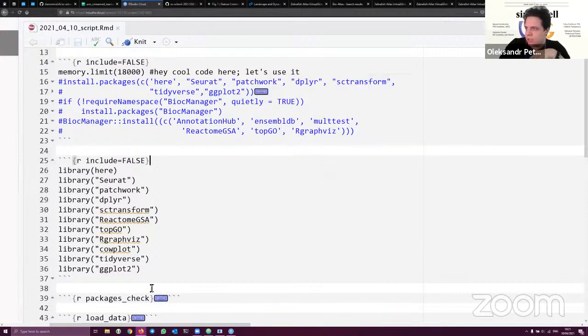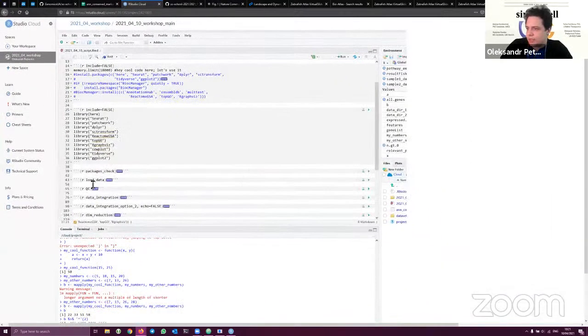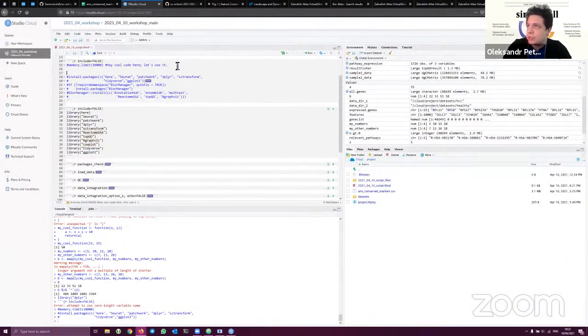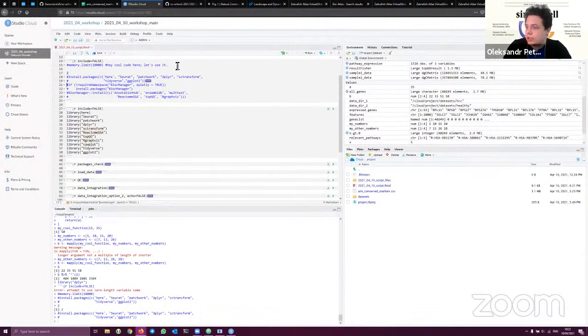So you copy paste it, just put it here, and to run all the chunks, you should press not Control Enter, but Control Shift Enter, and it will run all the code chunks. And in the output, but it doesn't work on the cloud for some reason. Okay, so I will just check one thing here. There is a chance that sometimes it happens with the cloud.